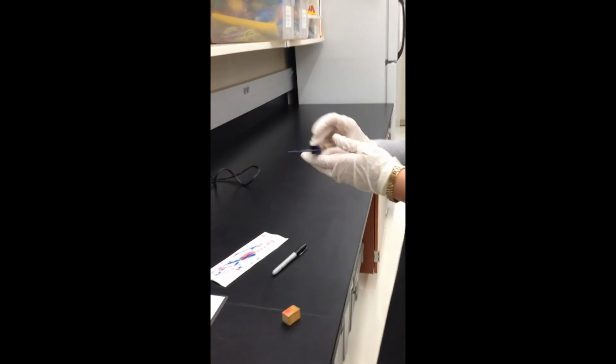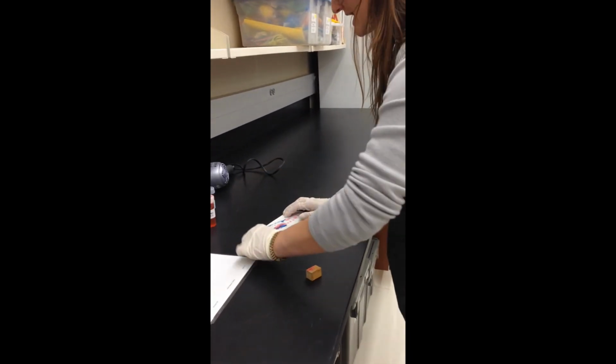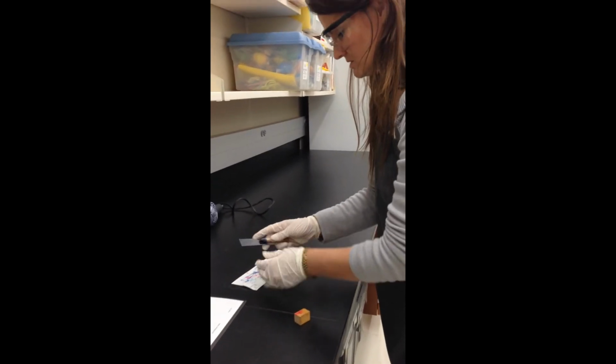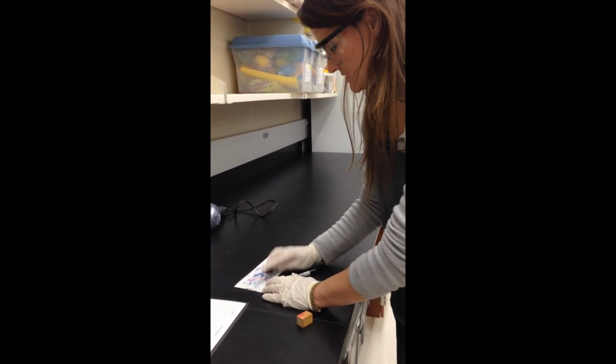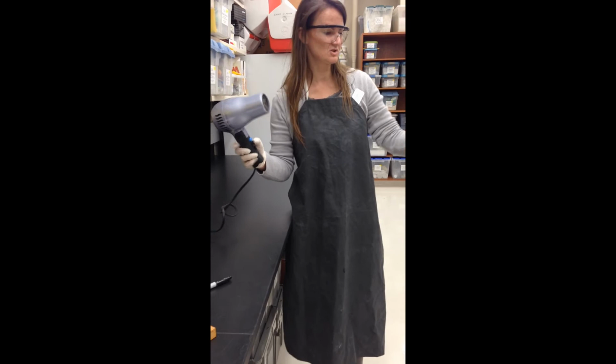Wave that dry, and you have a hair dryer with your kit, a couple for your class, so you may want to use that as well to help dry your slide along. Okay, you don't want to apply it directly to the slide, just kind of indirect.